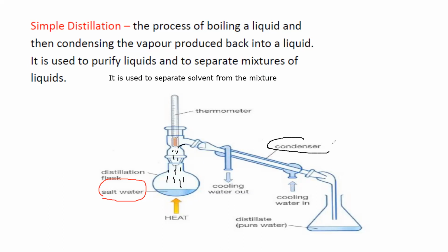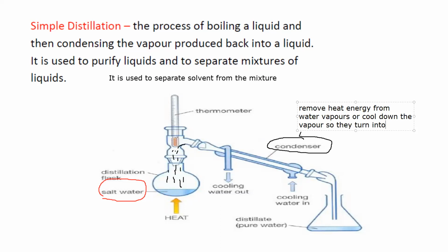What is the purpose of the condenser? The purpose of the condenser is to remove the heat energy from the water vapors, or cool down the vapors, so they turn into liquid state.